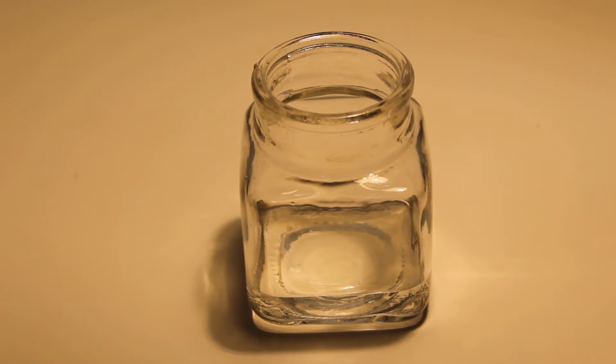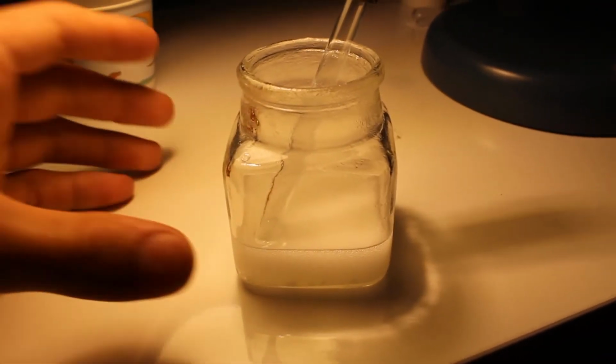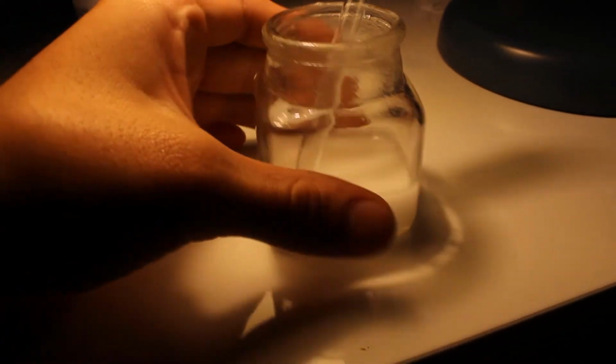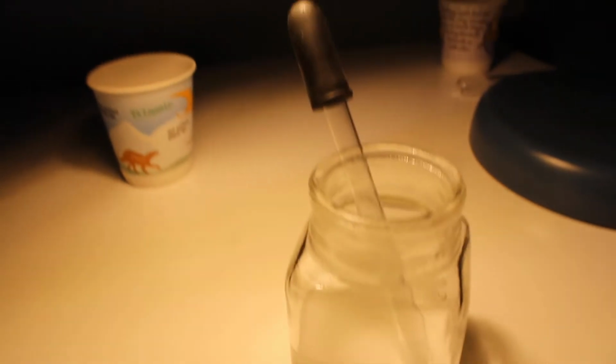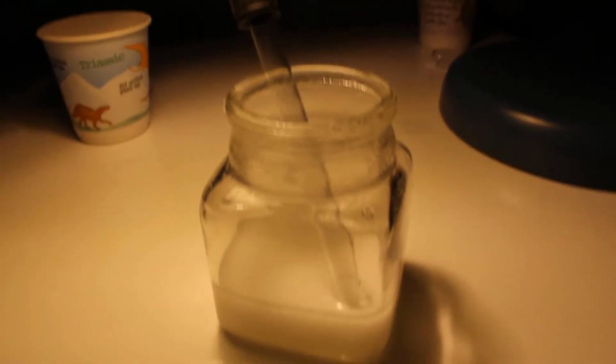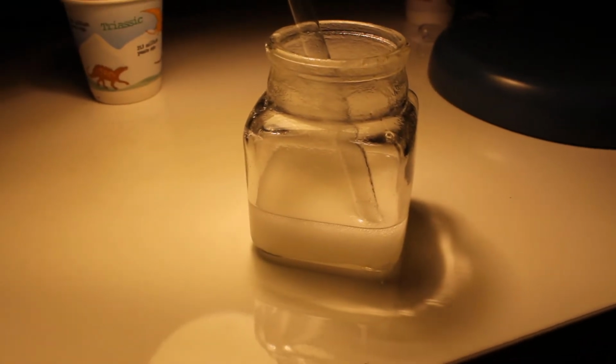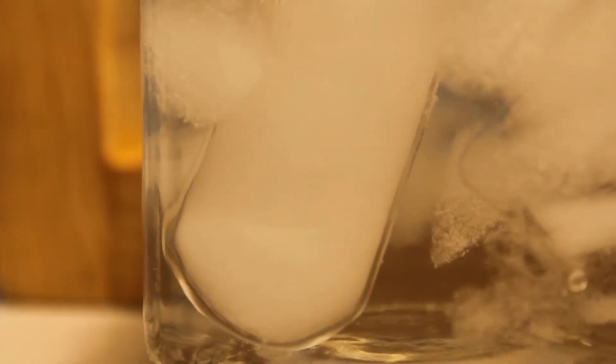Step 2, citric acid. I believe, yes. Unlike other reactions, this specific reaction is endothermic. It just takes heat away from things. So this glass is actually very cold right now after a lot of mixing. And it's also creating a lot of fizzing, even now. Very interesting reaction. An ice bath has been set up, and soon everything will be ready.